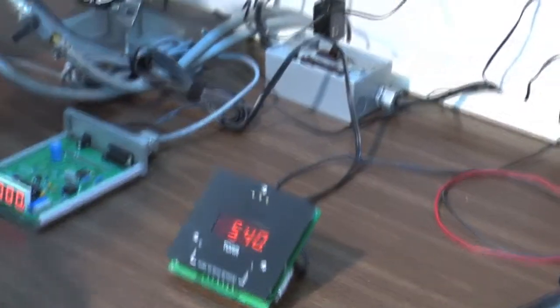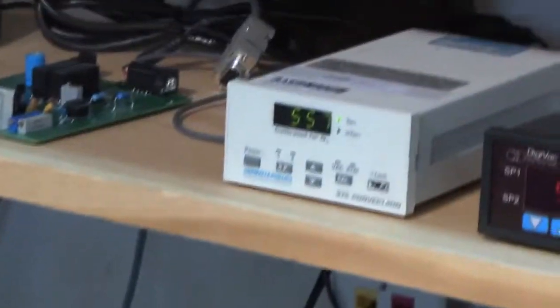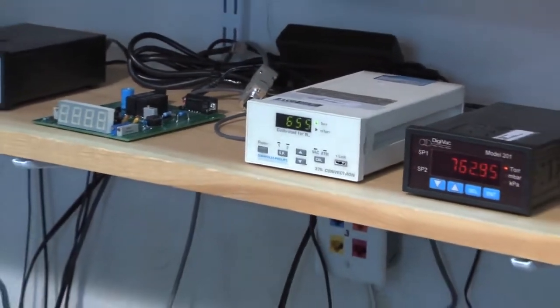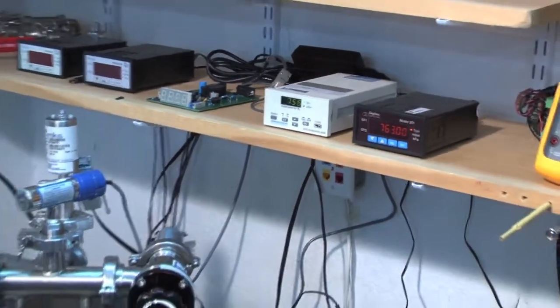560 torr, 540 torr. My last check for calibration is to vent my system all the way to atmospheric pressure and make sure we're reading approximately 740 to 760 torr, and we are. This is our properly calibrated Digivac 801W vacuum gauge.